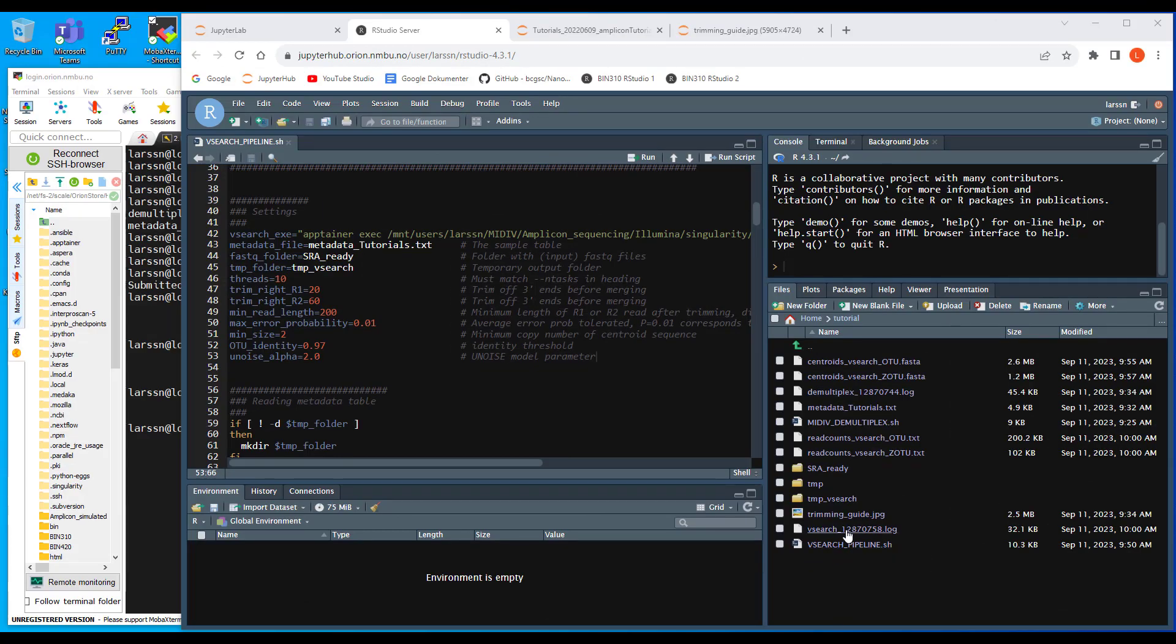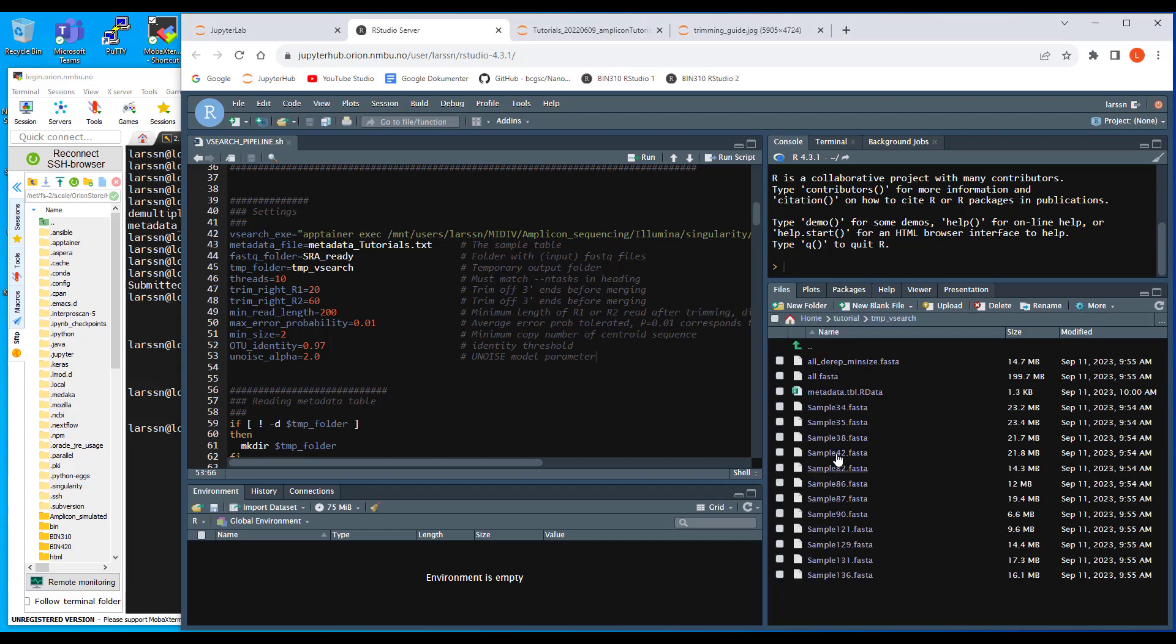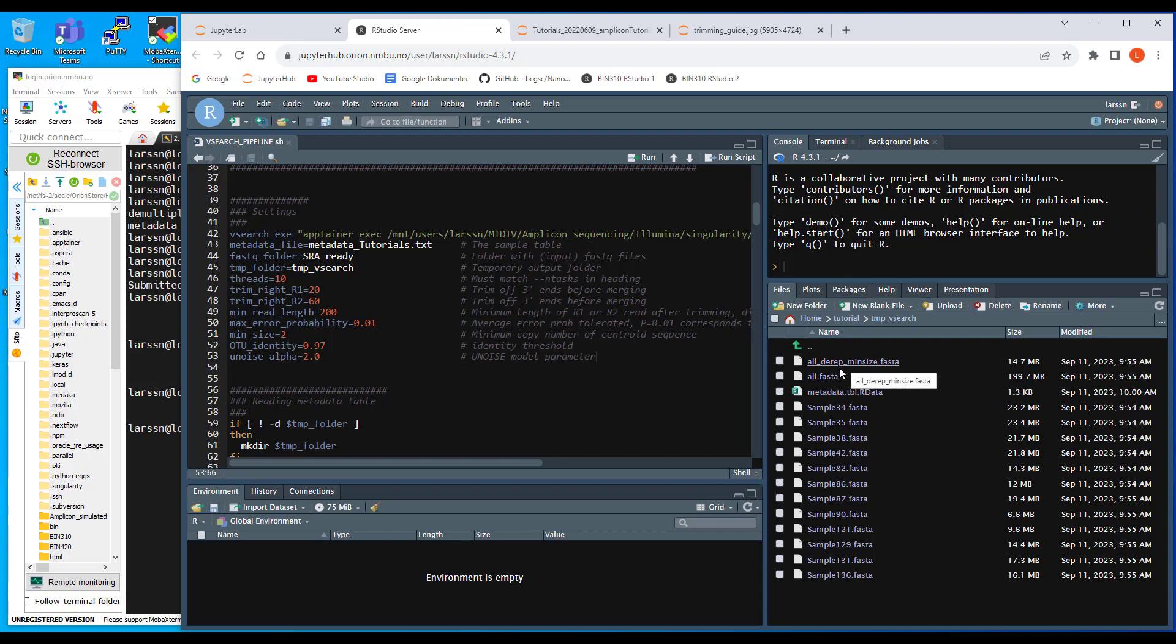And we can see that the output. First of all, we can have a look at this tmp folder. There should now be one fasta file for each sample here. There should also be a fasta file with all reads from all samples merged, or not merged but assembled into one big file, and also a dereplication of that one.